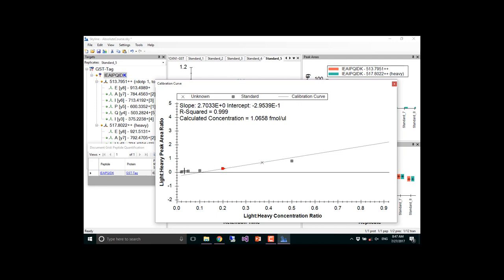And then you can see that maybe things level out at the very bottom. There's probably some minor difference that I don't think we're going to have time to figure out. But as we've seen before, it can be hard to follow all the steps, but there's nothing non-deterministic about this. If we had exactly the same settings, we would get exactly the same results. I can come over and look at it later.